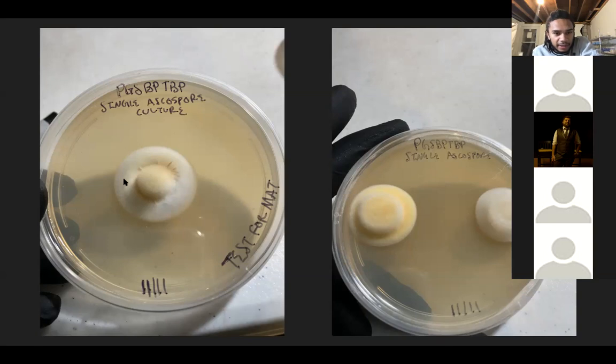If you notice that on the left, you can see fruiting bodies coming out, obviously that's not a single spore. Single spores won't produce fruiting bodies. So I got rid of that one. Sometimes I'll put multiples on one dish just to save petri dishes. But as soon as they start growing out, separate them so they don't breed with each other.